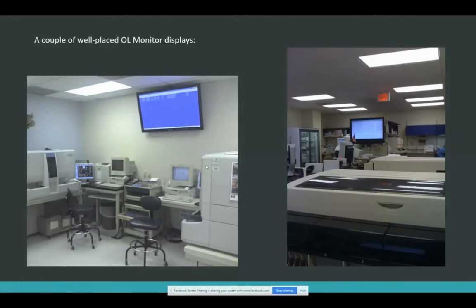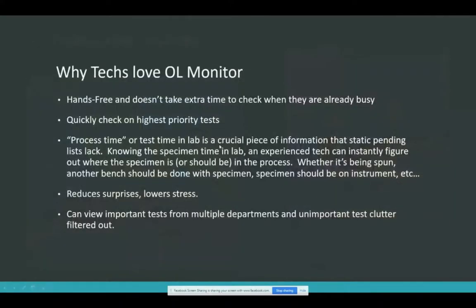A lot of labs like to have a stat board type situation here, but you can display anything on OL Monitor, not just stats. The filters let you do whatever you want with it — you can do a combo. A lot of techs have told me they can't live without it. I work in a laboratory where we use OL Monitor and it is very, very helpful. Honestly, I don't know how we made it before we got it — but I'm biased.